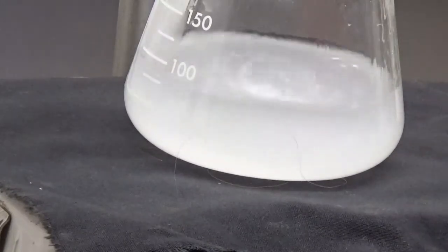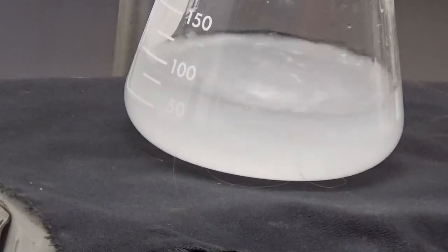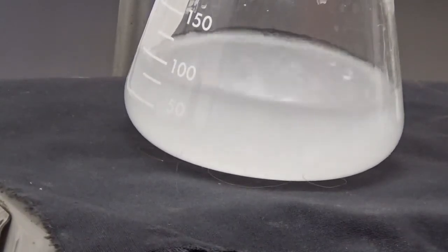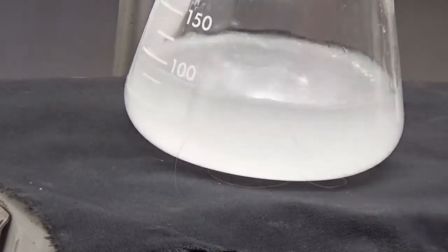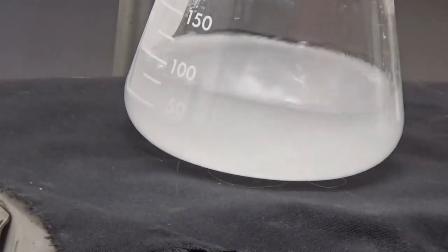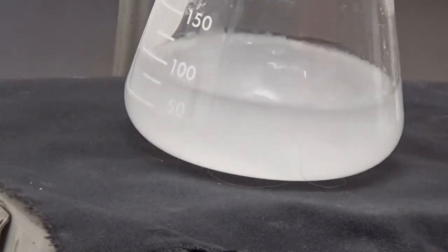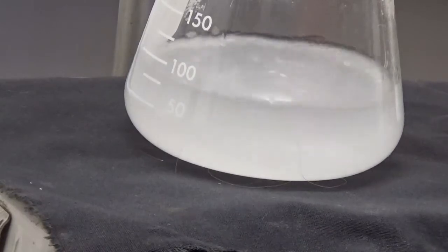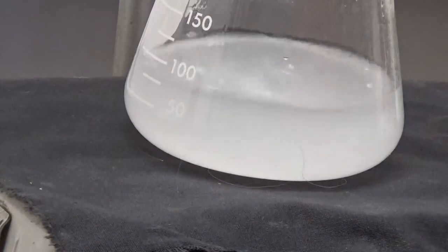It's 5 more drops. 5 drops. It's looking like it's going to be soon. I don't know. Maybe not that soon. It's still pretty cloudy. Although I thought it would go from cloudy all at once to clear, it seems like it's happening more gradually than I thought.